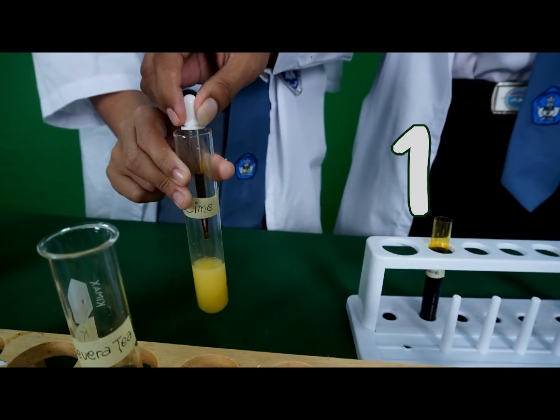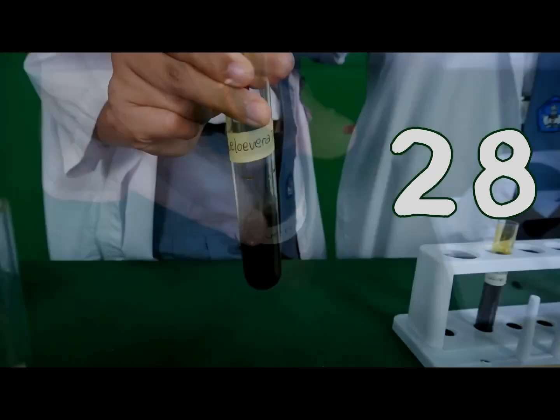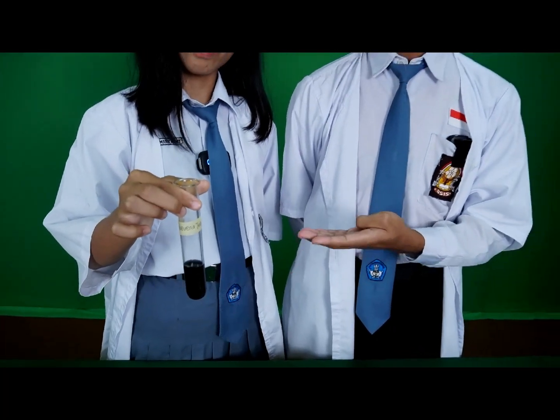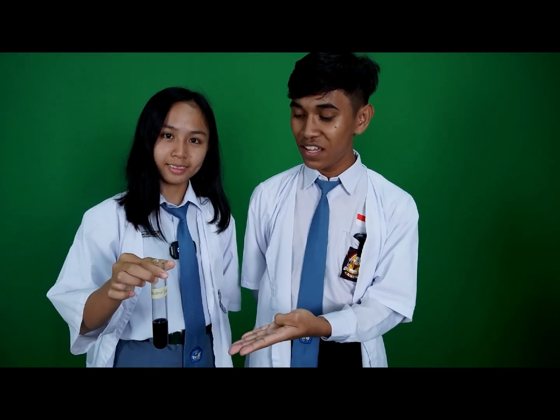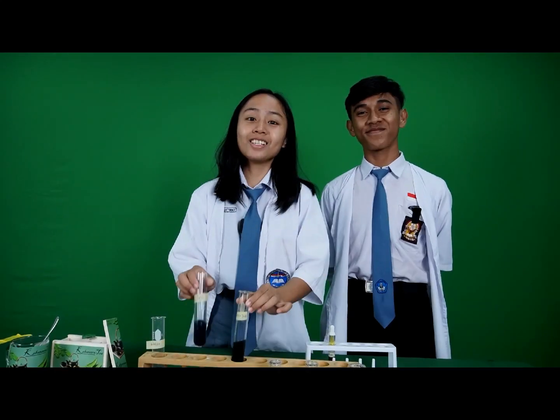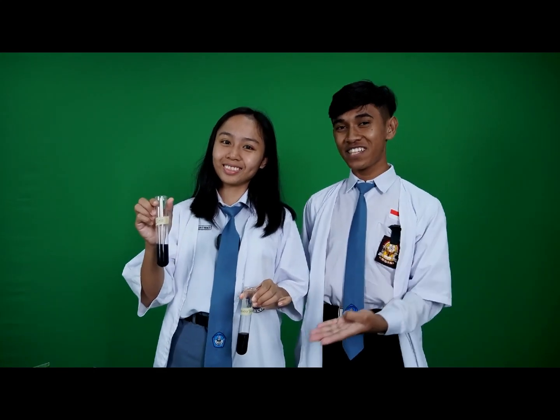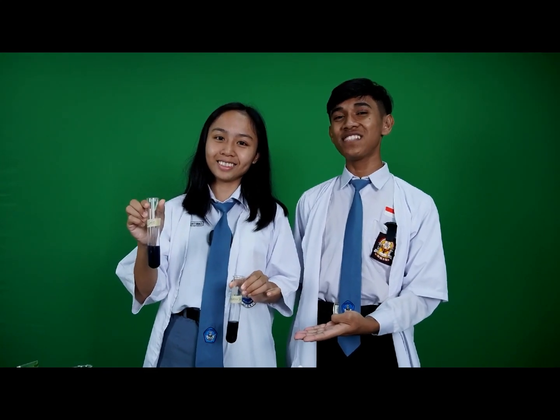In tap water, we need 2 drops of iodine. Keloevera tea needs the same number of drops as lime to change the color, 28 drops. This means Keloevera tea is the same as lime. Keloevera tea is positive for vitamin C.